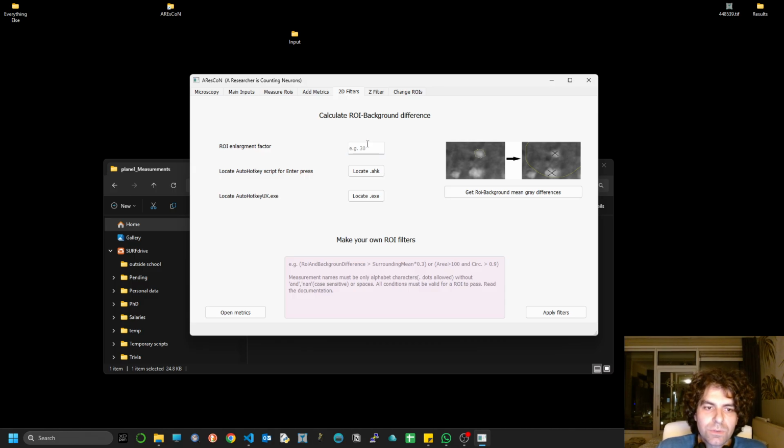So what we're going to do here is take some relative background measurements, as I call it. And what this is, imagine that you have an observation, a prediction of a row here.